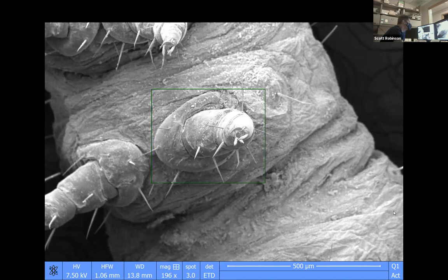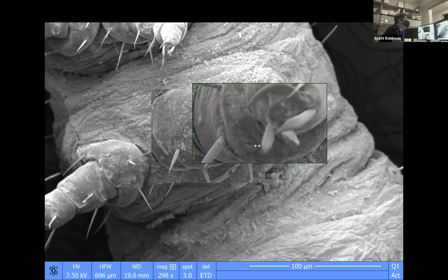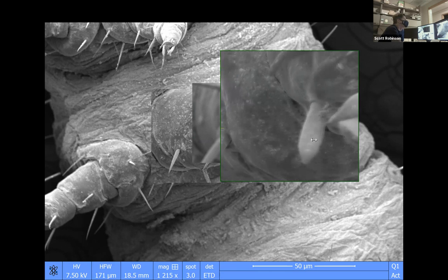They have another name too. I forget what it is. Yeah, but it is a proleg. And I think crochet is something that is referred to. Yeah, that's what it is. Well, I don't know if that's the whole leg structure or just the span of hooks that they have at the end. Crochet.